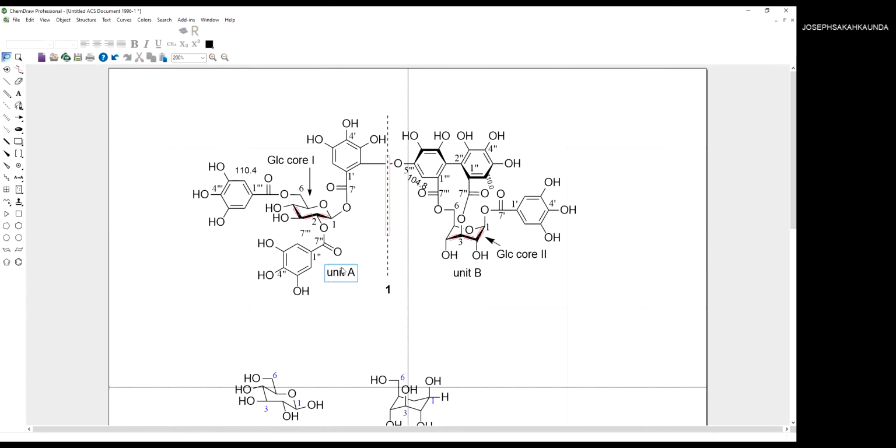Now we want to move out, to gain territory. What more ground can we gain? Then you move from this proton and check HMBC. Let me look at the value of this proton. That's proton number 2.